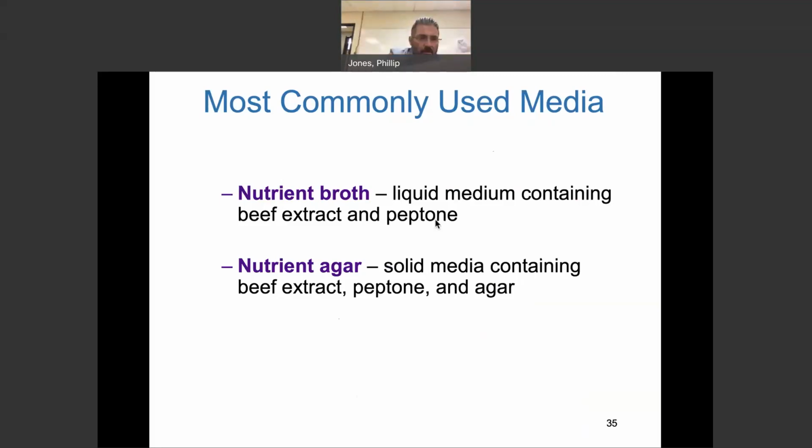Same with this. But I don't know if it's alive. I don't even know if that's alive on there. Looks like it might be alive, but until I re-inoculate something and grow it, I don't know if it's still alive. If I swab something out there and put it on a plate and put it in the incubator and nothing grew, I would say, well, either I did it wrong or that stuff was deader than dead.